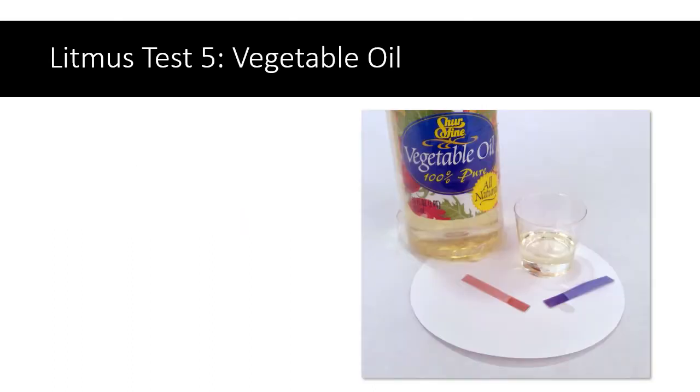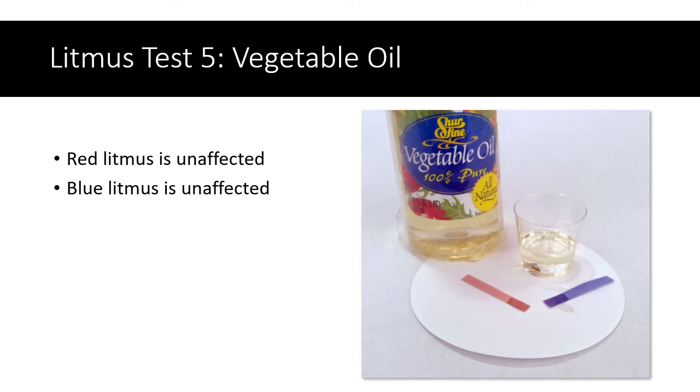One more — vegetable oil. The red litmus that was dipped in the vegetable oil stayed red, and the blue litmus stayed blue. Like the water, vegetable oil doesn't seem to have any effect on litmus.